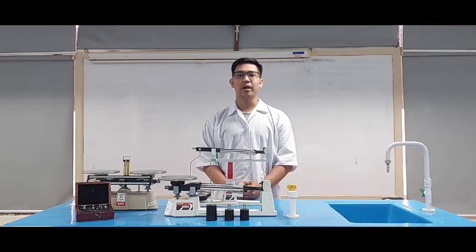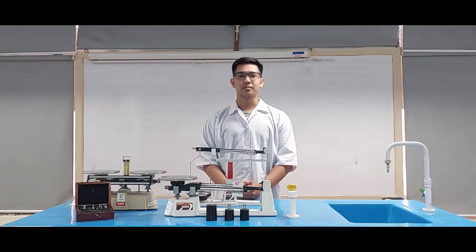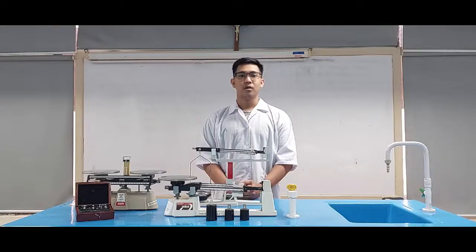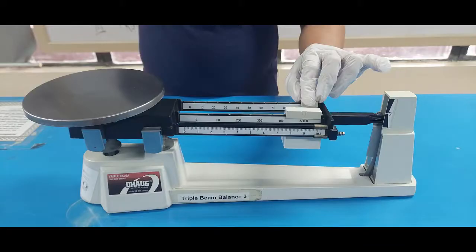Avoid spills during weighing activity. Do not overload the balance; weigh samples only within its capacity. When moving the balance, place your hands on either side of the base for stability. Use a tissue to remove any chemical which may have been spilled on the balance. After working with the balances, place the riders at the resting position.